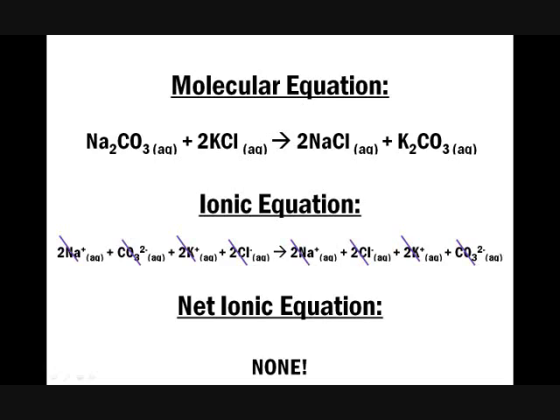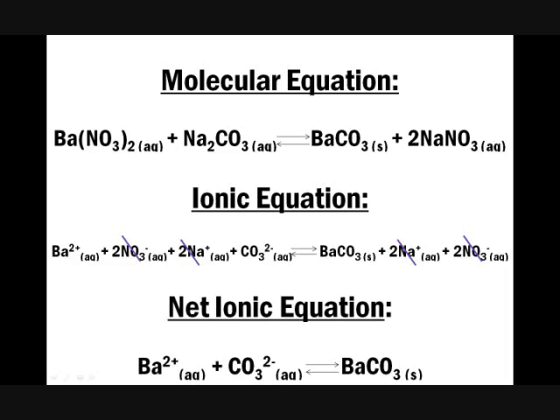Sodium carbonate and potassium chloride, and it didn't make a precipitate. Barium nitrate and sodium carbonate, that one, it makes a precipitate. Sodium nitrate and sodium carbonate, and it didn't form a precipitate.